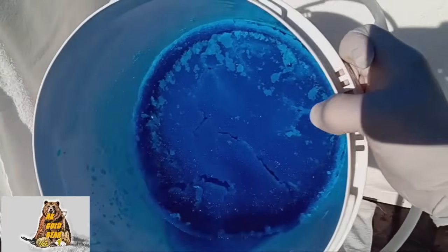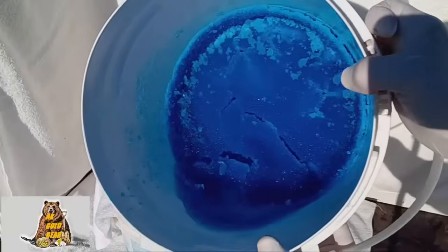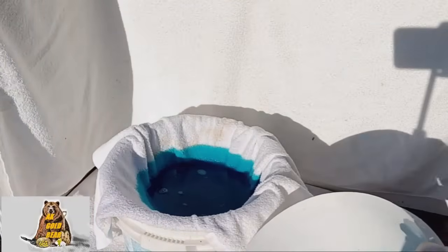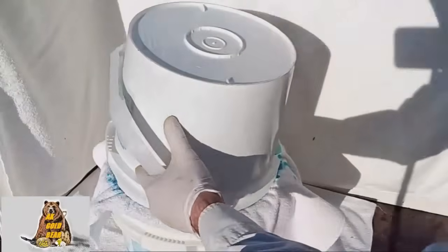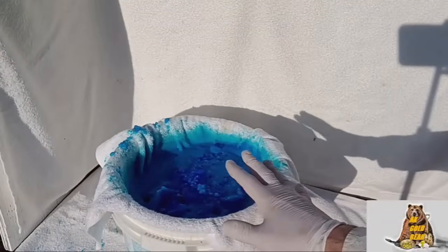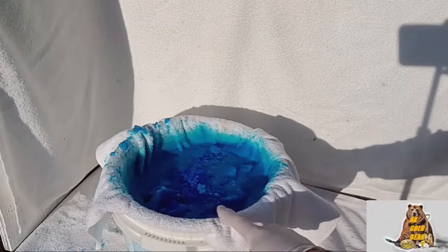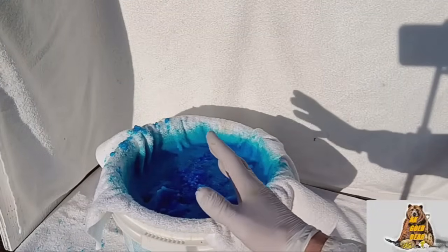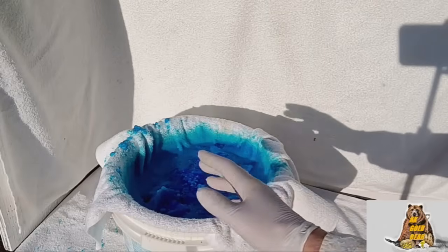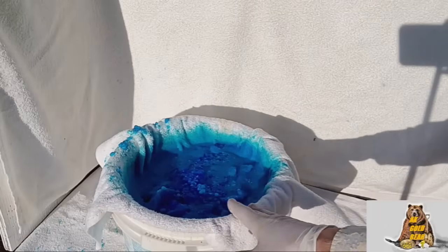Okay, a good amount of copper sulfate, beautiful crystals. Now I will leave the copper sulfate on the filter so that all the liquid flows down. And after 2-3 hours I will grind all the crystals in a mixer.